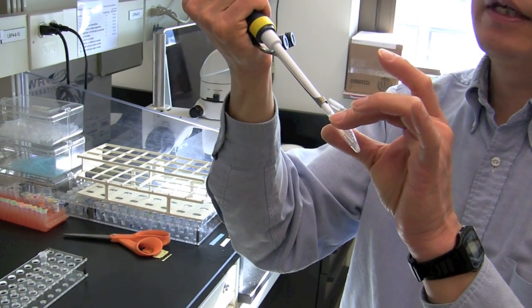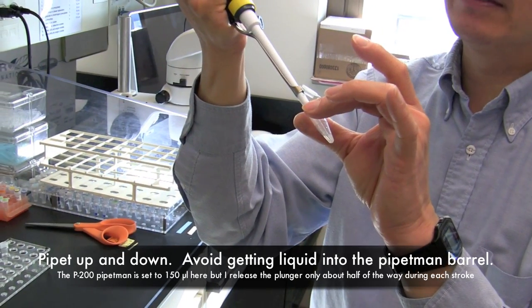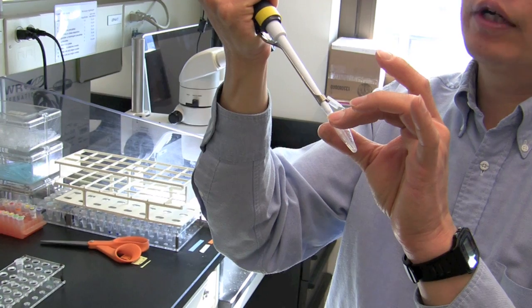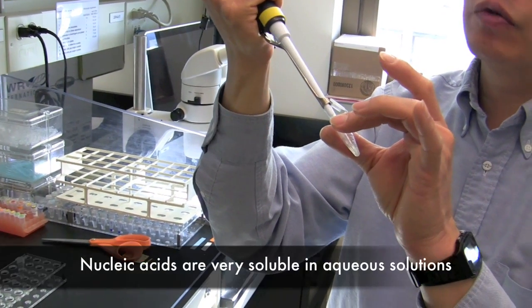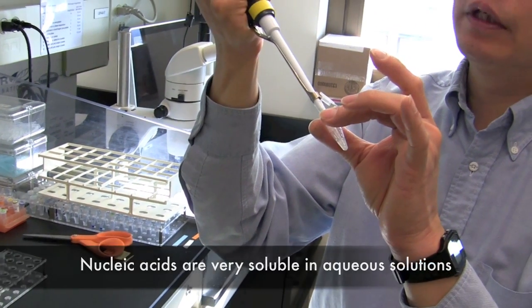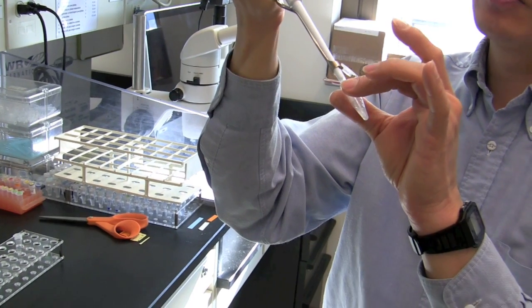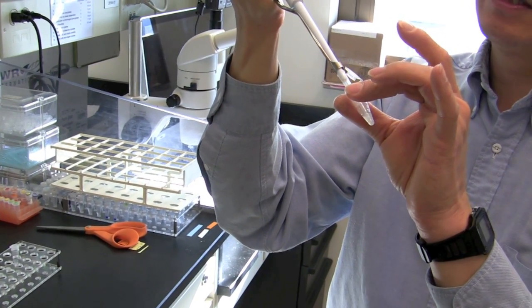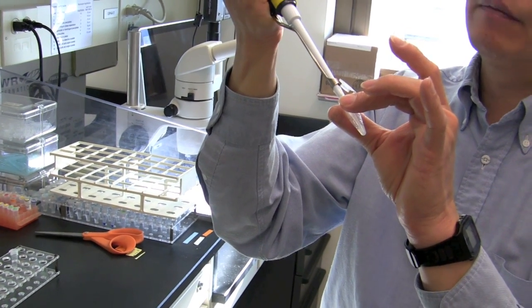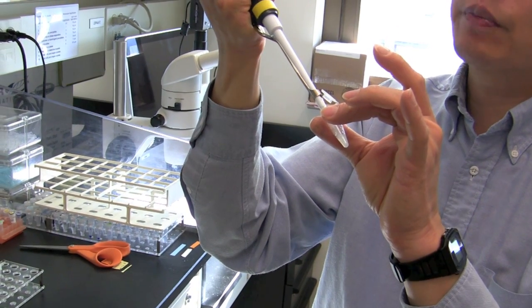The way I resuspend it is I'm blowing at the pellet, and I'm actually trying to grab onto the pellet. As it travels through the tip, it gets broken up. Because it's mostly nucleic acid, it goes into solution very easily, but it has to be broken up to dissolve properly. So you can see within a few seconds, that pellet is starting to disappear. The solution is becoming more milky. I want to resuspend this to the point where I don't see any clumps, where it's essentially a homogeneous solution, at least a suspension.